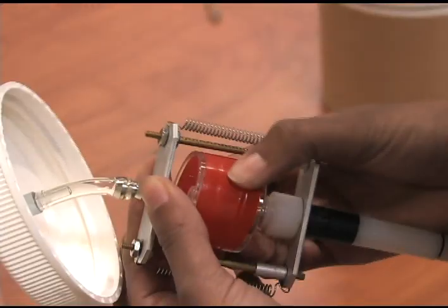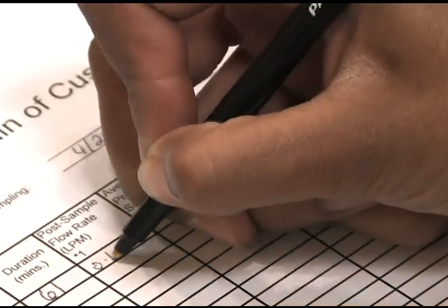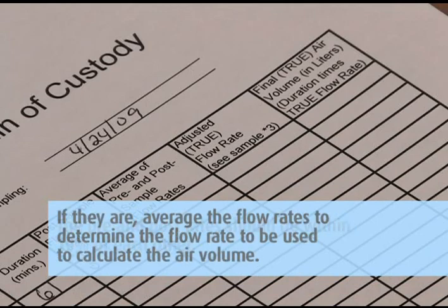Perform the post-calibration the same way you did the pre-calibration, but do not make any adjustments — just record the flow rate on the pump calibration sheet. The pre and post rates should be within 10 percent of each other. If they are, average the flow rates to determine the flow rate to be used to calculate the air volume.